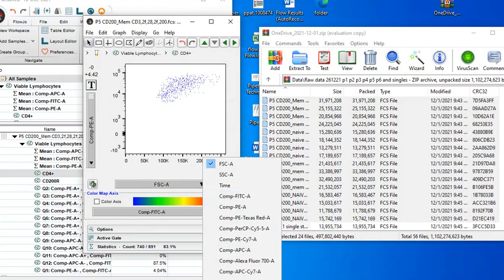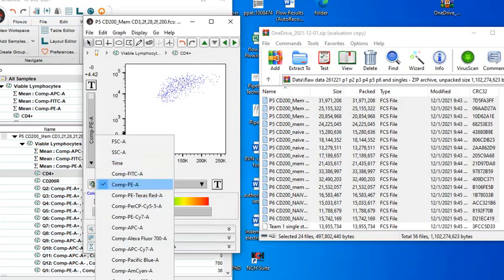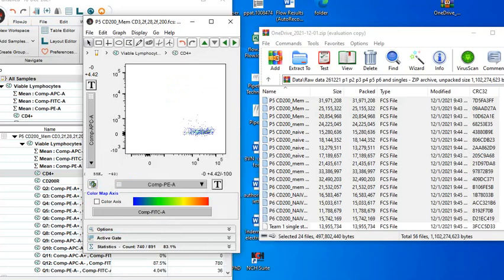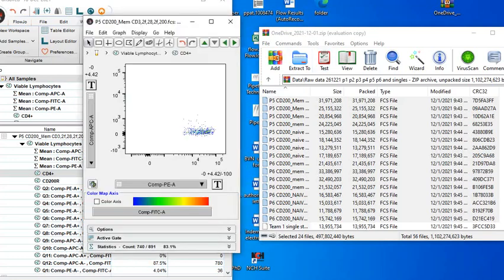So I would try to do more analysis on this so you can actually do it yourself and be comfortable while you run the analysis on your own, without fear or favor, without bias, without wondering what the person you have handed your sample to is doing with it.